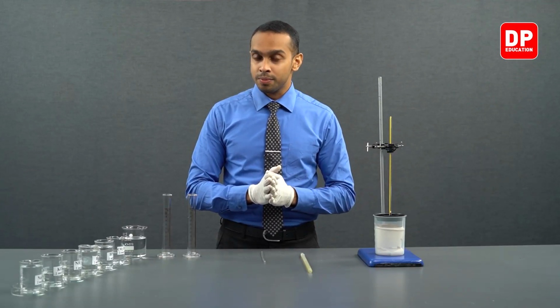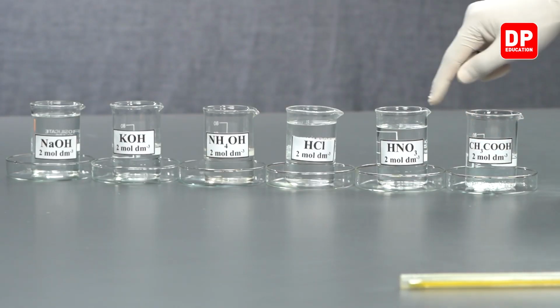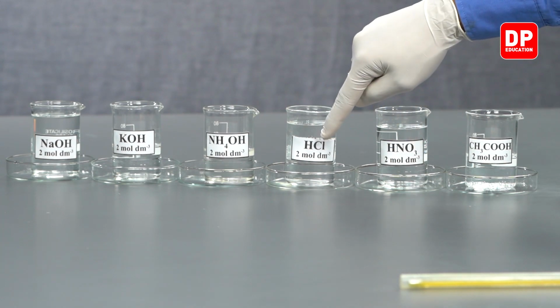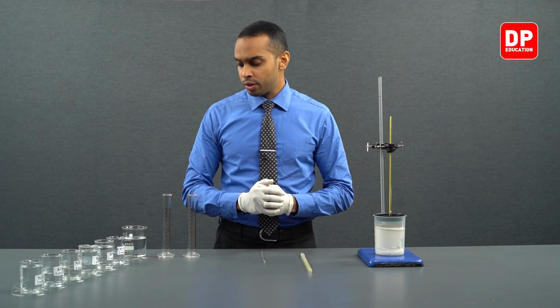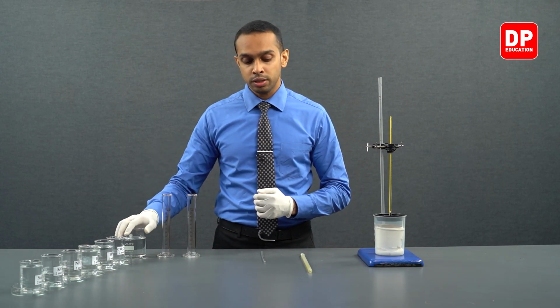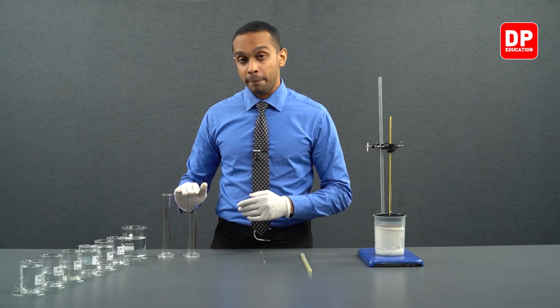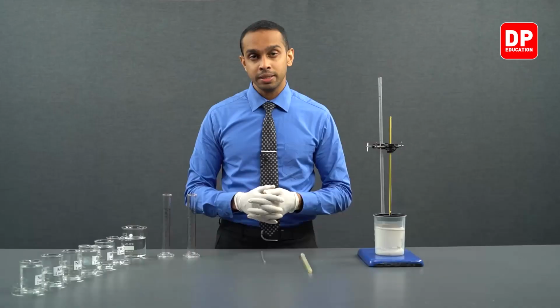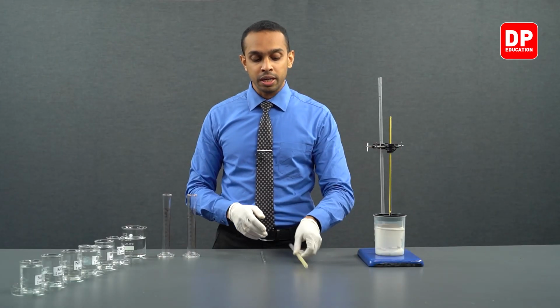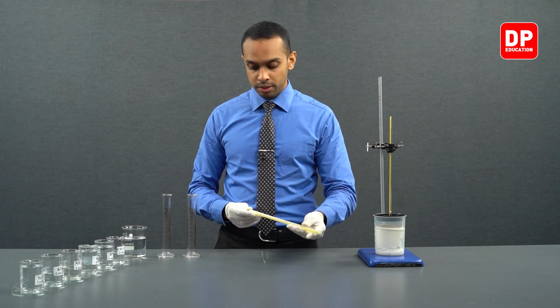All of the acids also have the same concentration, which is 2 moles per decimeter cubed. Apart from the acids, we will be using a little bit of distilled water to wash the utensils we are using. We will be using measuring cylinders to measure the acid and the base accurately. We will be using a thermometer to measure the temperature accurately.